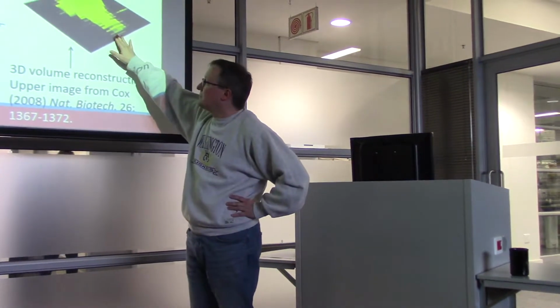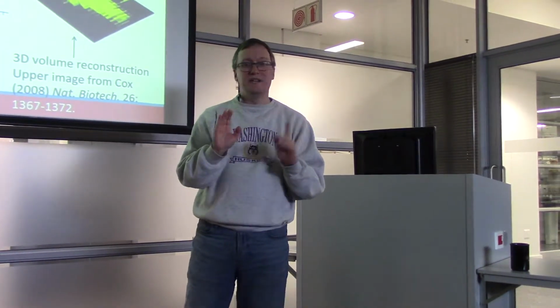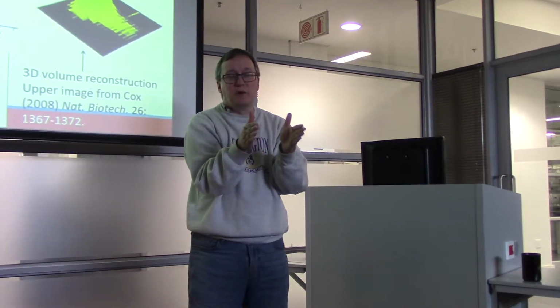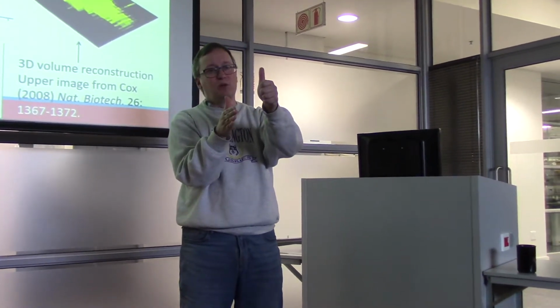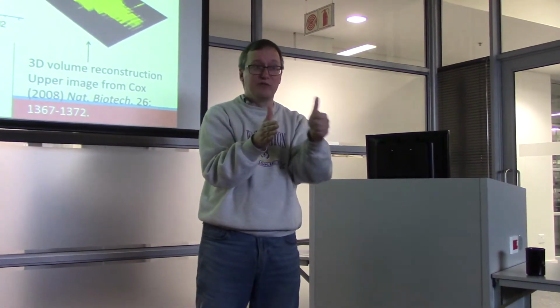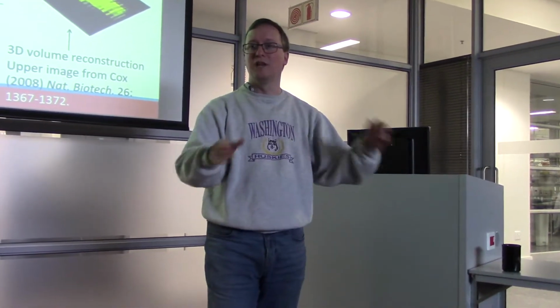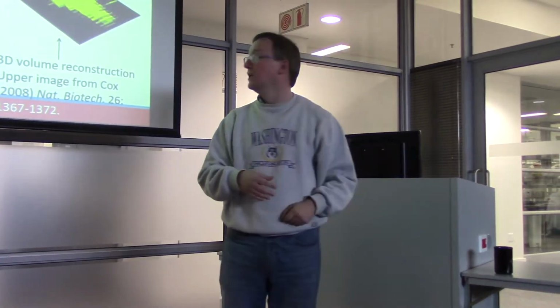So in this case, we're able to do two kinds of corrections here. One is that because we are looking at all of the m over z values within a 20 m over z space, we can see that some intensity is visible even a little bit off the center of where we expected this peak to be in m over z space. And we can see that this peak is not just appearing in one MS scan and then vanishing. It's rising rapidly and then trailing off as a function of time.